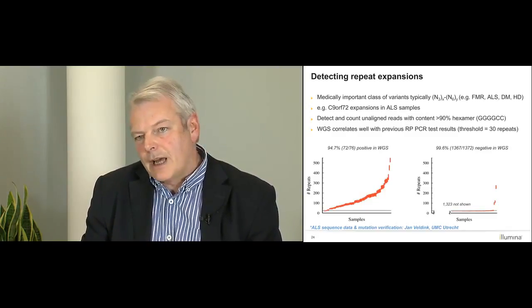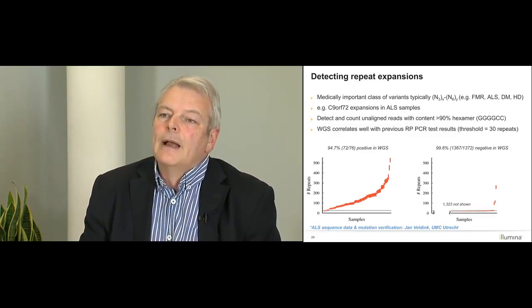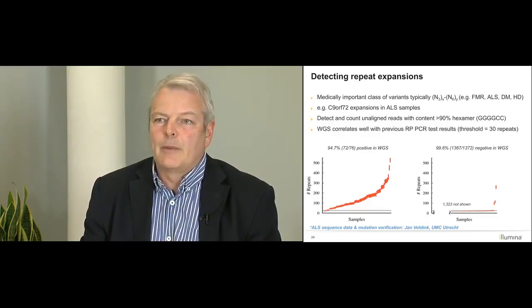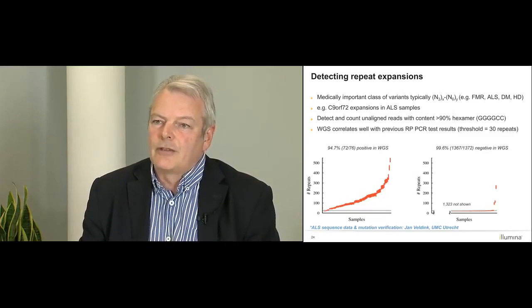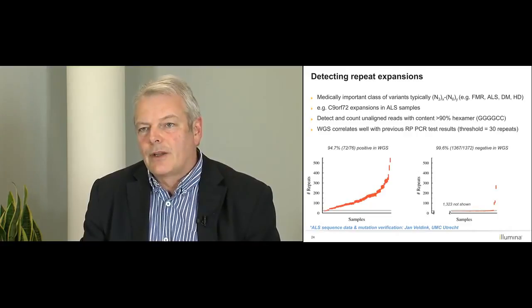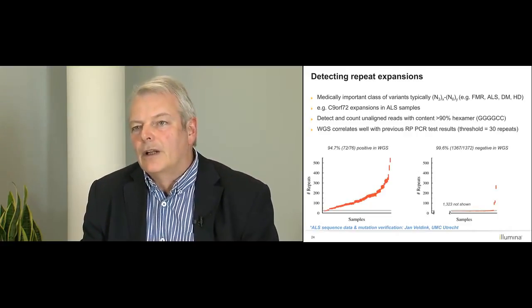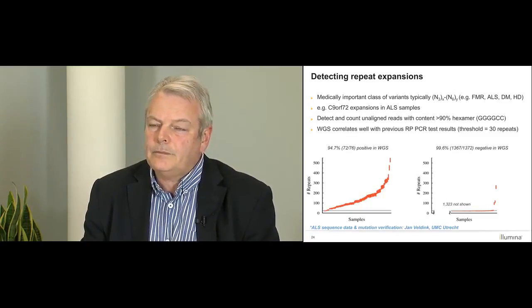And we can write algorithms to extract information such as what you see on this slide. And at the same time, you can incorporate those algorithms into the pipeline. So we're extracting much more information about CNVs, junction fragments, and these repeat expansions in whole genome sequence data. These algorithms have yet to be folded in most cases into the pipelines. But this illustrates just one of the growing points in our research, and this is all in collaboration with various clinical and molecular investigators around the world.